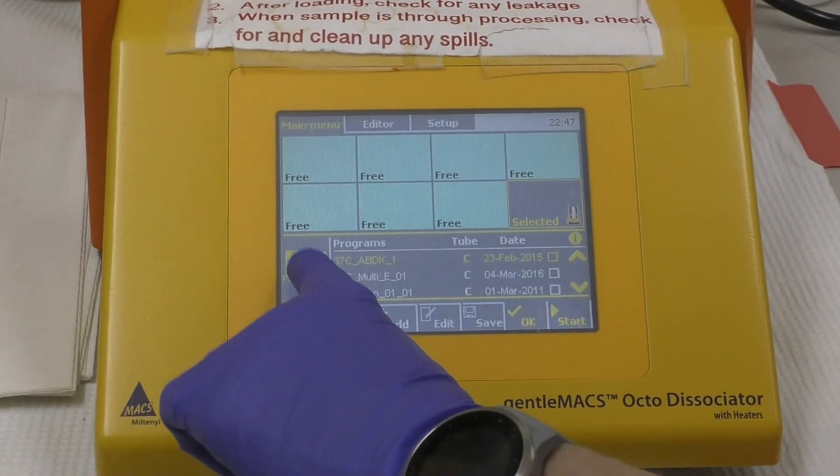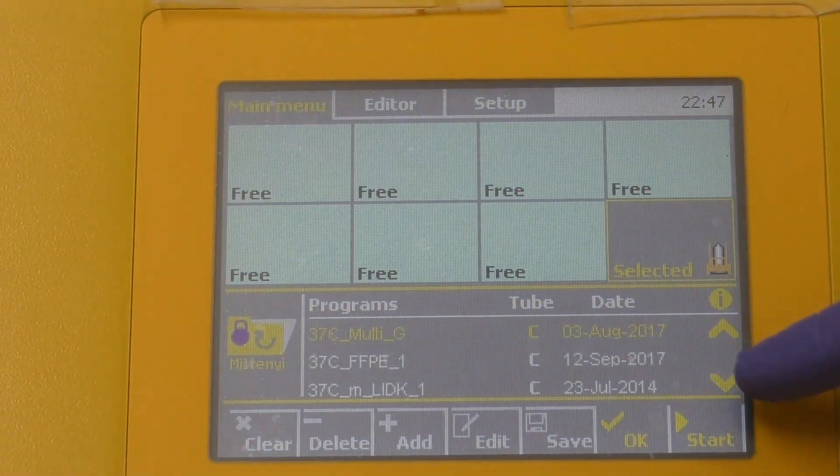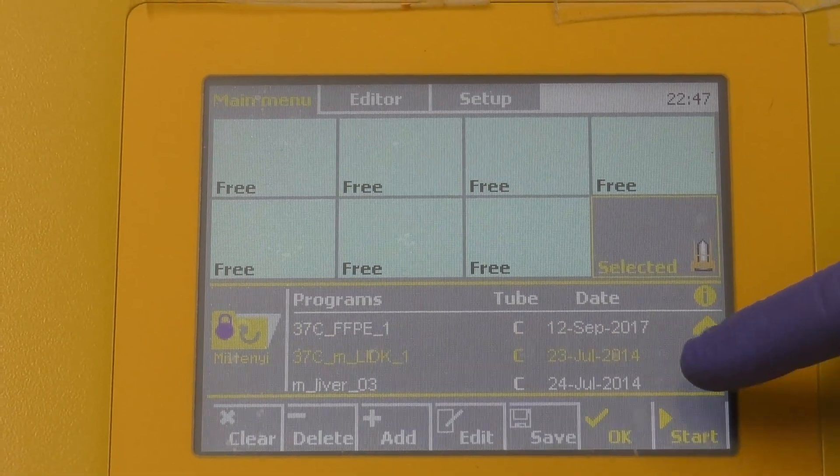Next, go to either the Favorites folder if your program is in there, or the Miltenyi folder. Scroll down until you find your program.